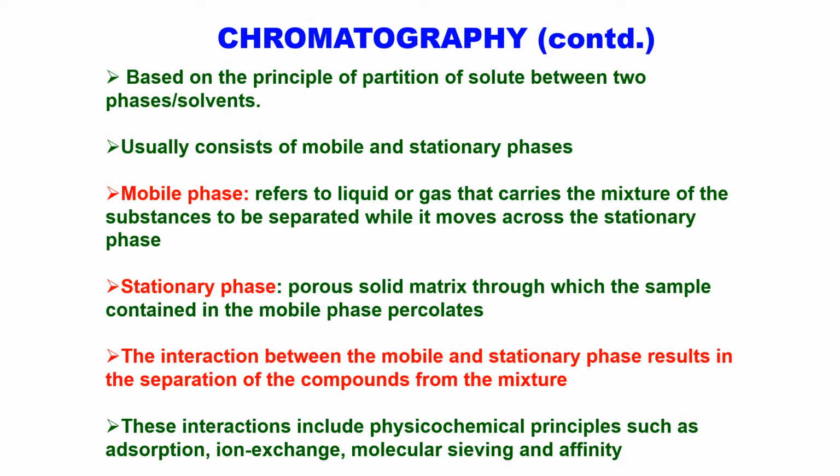So what does chromatography basically do? With this technique, we're trying to identify either the composition of a mixture or to detect a particular otherwise known component in a given sample. The sample can be anything: river water, serum, plant extract, a forensic sample, a urine sample for a dope test, etc. The sample is run through a stationary phase, and based upon the inherent characteristic property of that particular analyte, it is identified.